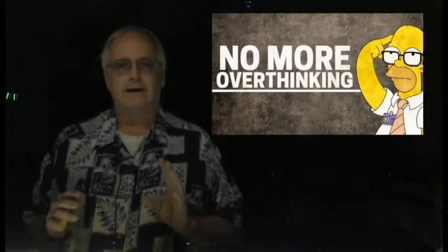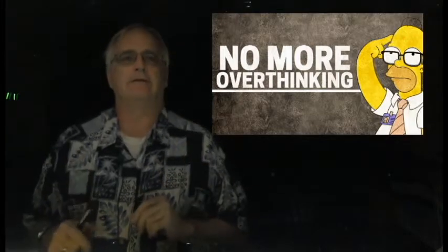When students are first trying to learn NMR spectroscopy in their undergraduate career, it can be, let's face it, an overwhelming topic. But for a lot of the early type problems that students have to do in NMR spectroscopy, say in an organic chemistry class, the early problems, getting your feet wet, it works best not to overthink it. A lot of students try to read way too much into these things.